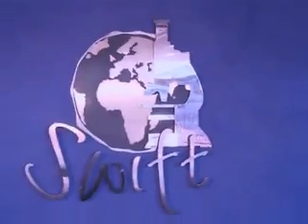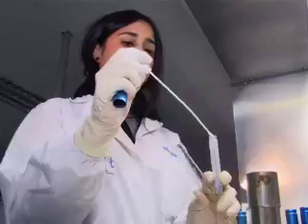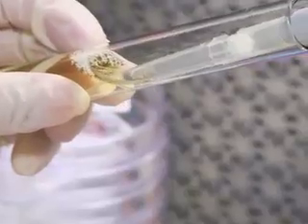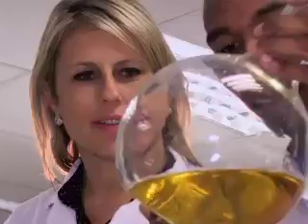The samples are carefully transported to the lab to eliminate any potential contamination. Once the sample arrives, it will go into a fridge where we will store it until it gets tested. Our main aim is really to keep the sample sterile until we've opened it. So the microbiologist will get the sample from the fridge. From there on, they will plate it onto a nutrient media which we use to grow up the bacteria. It will then be incubated at a specific temperature for a specific time period. In this specific case, some of them we've incubated for 48 hours and some of the other ones we've incubated for 120 hours.